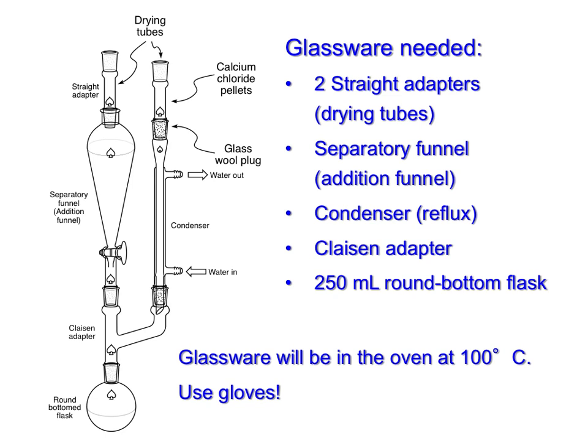We will put in each a little plug of glass wool in the bottom, then fill it with calcium chloride pellets, then put a plug of glass wool in the top to hold those in there.